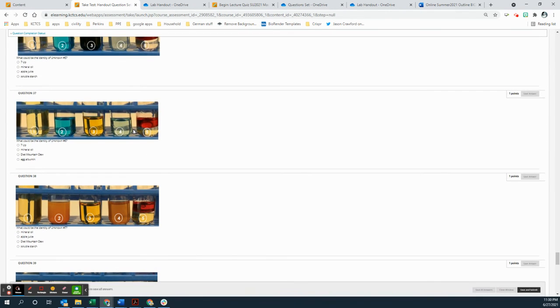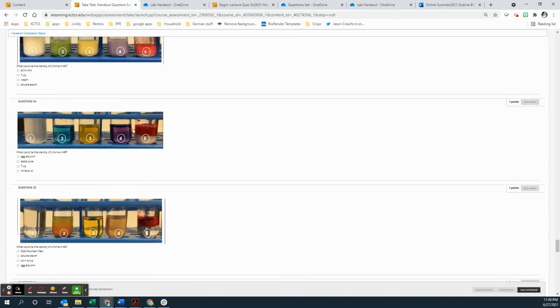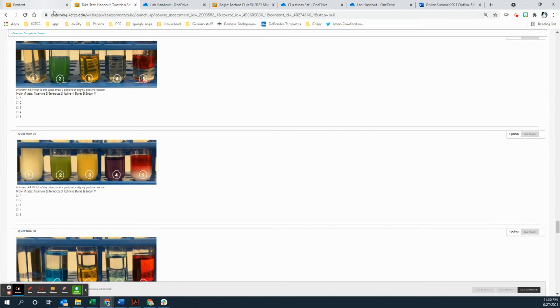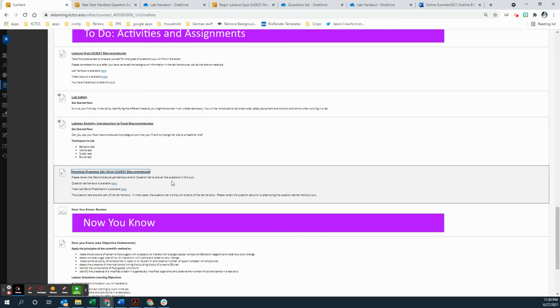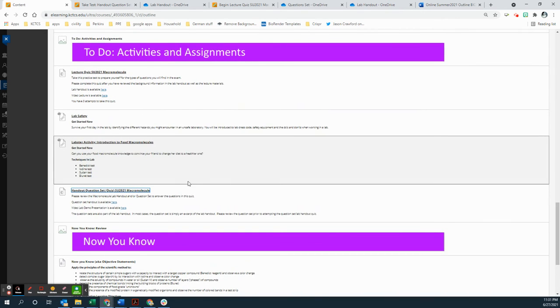When we do this in the lab, we can actually smell too, and so you can have an idea of what something is based on that. So like I said, when you get to the handout and you're like, I don't know how to even figure this out, don't despair, because in the quiz it's not going to be as hard. And that's really it for the macromolecules.